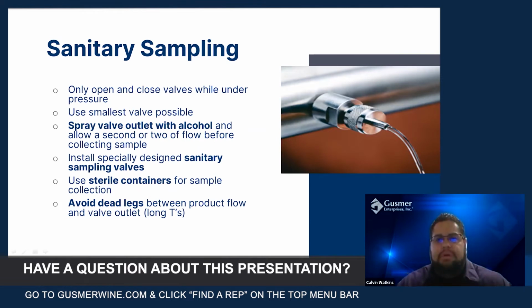Sanitary sampling, and we'll get into this in detail later on. When you're taking a sample, you really want to open and close the valves while under positive pressure. There's a photo there on the right. Liquid's coming out. That's a good time to close the valve.